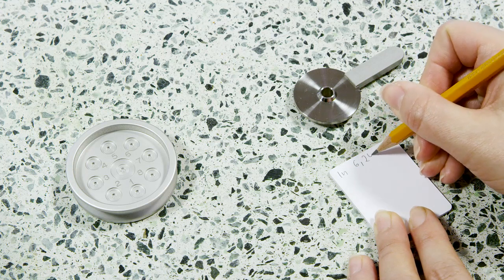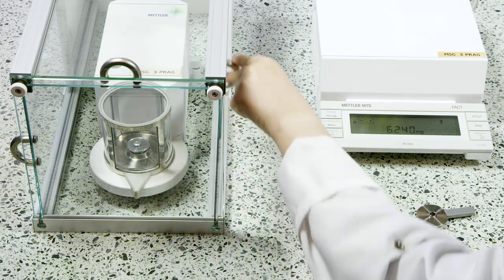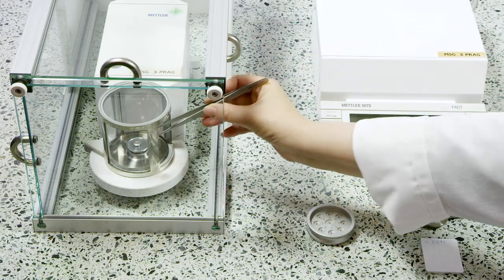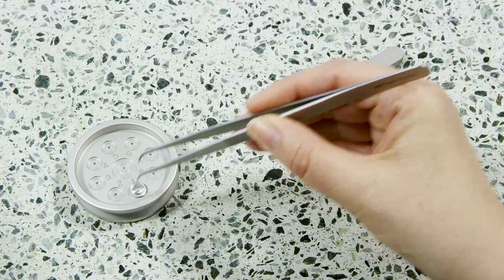If the balance is connected to a PC, the weight can be directly transferred to the experiment window of the STAR-E software with the push of a button. Place the crucible onto the crucible support.